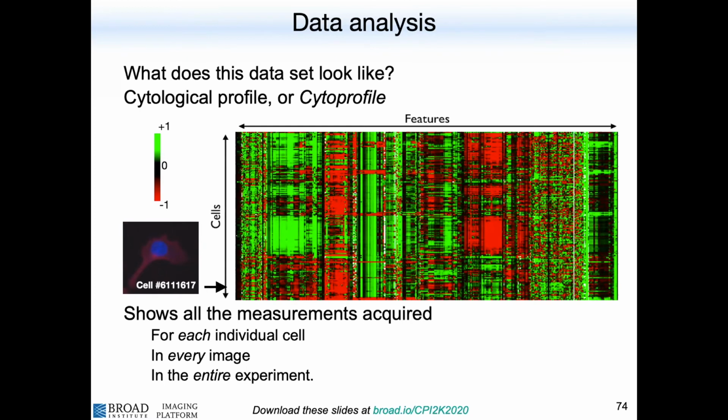It shows, for specific measurements along the x-axis, whether a specific feature goes up and down on the y-axis in certain cells. This allows us to take a more overall look and see whether certain features are up or down, and then predict certain phenotypes in specific cells. And all of these we do with CellProfiler-Analyst.